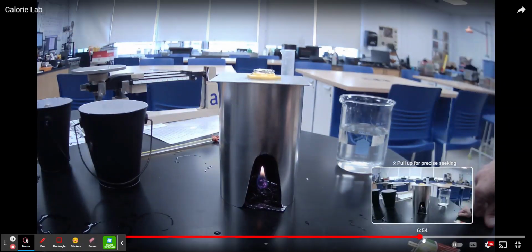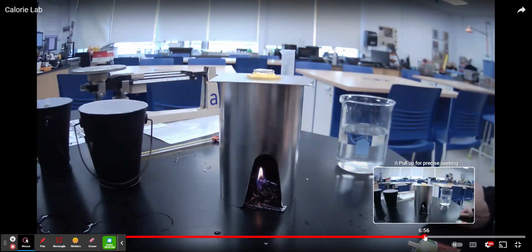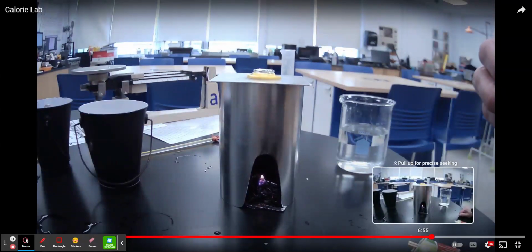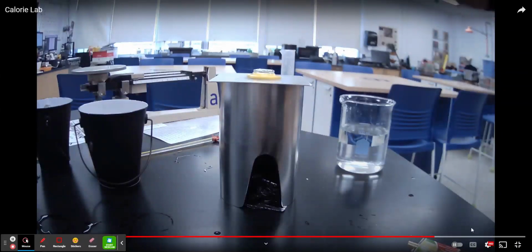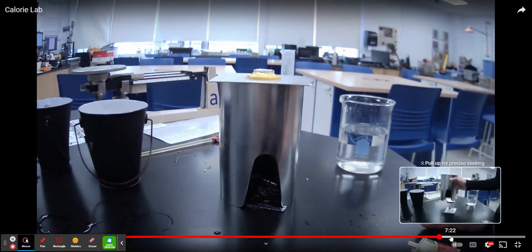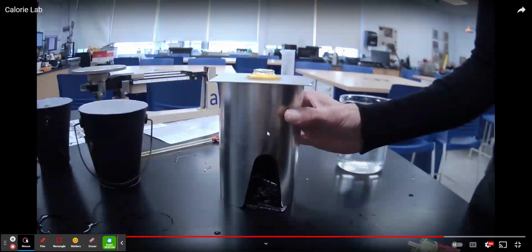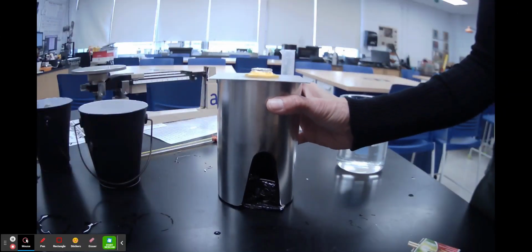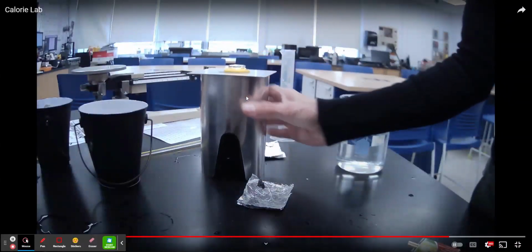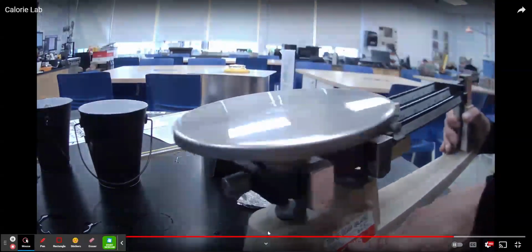And then you're going to allow the food to completely burn. If it goes out, you can take the splint and relight the food. You do not have to burn the entire amount of food. You're going to weigh it and look at how much of the food did not burn. So if some of it doesn't burn, that's fine. Okay. Then you're going to take the temperature of the water. Be sure that when you handle that, it's hot. There will be tongs there if that does get hot. The paper clip is also very hot.